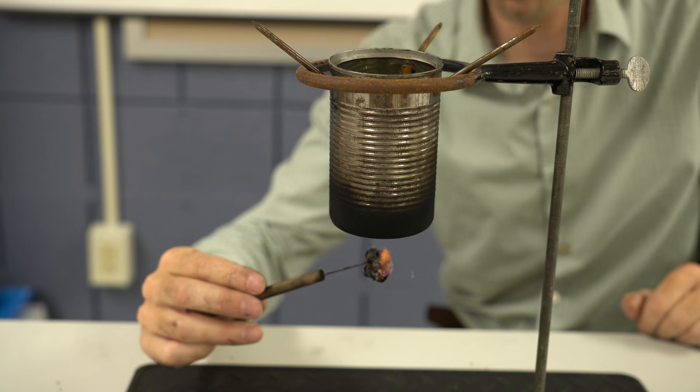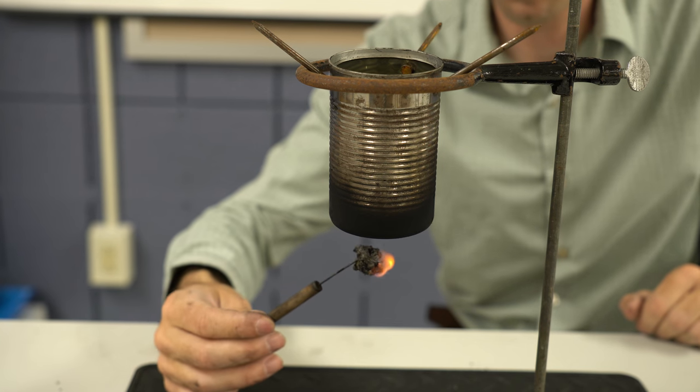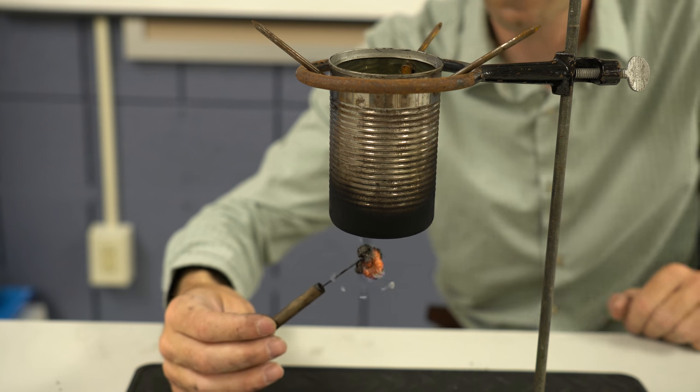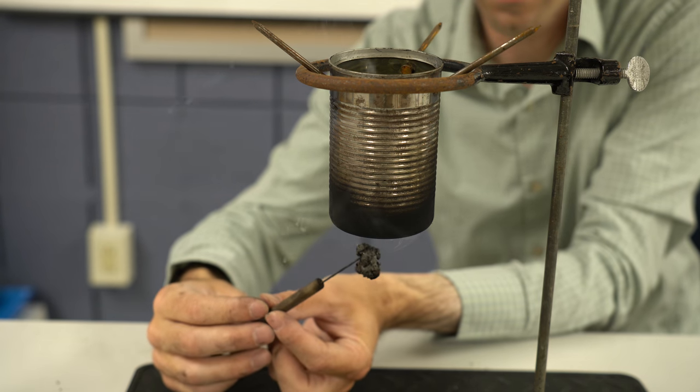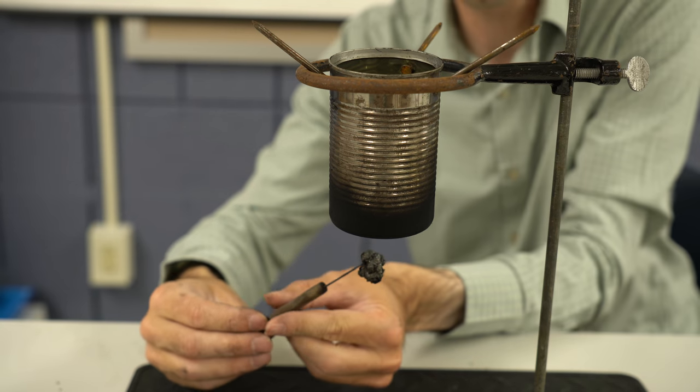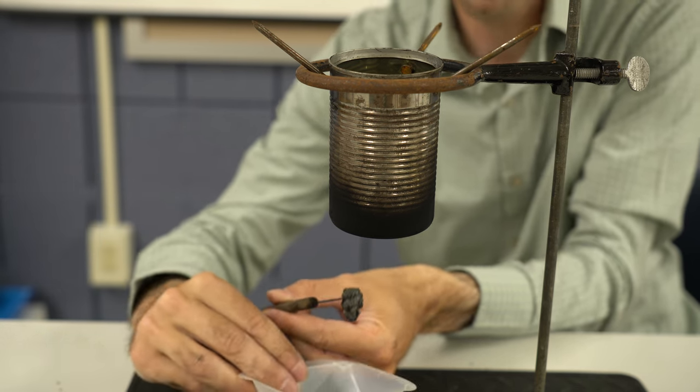If it does fall, you try to grab it again and again, try to rotate it as best as possible. Different food items will have a little issue there. And you could hear that the flame just went out. So I'm going to take this marshmallow now that's burnt, grab a weigh boat, put it in there.